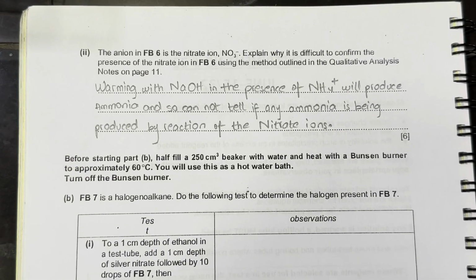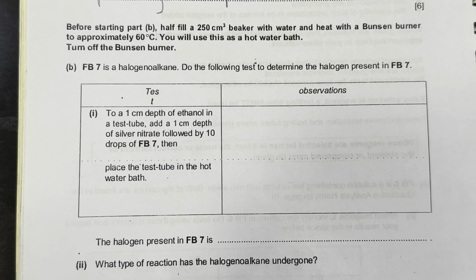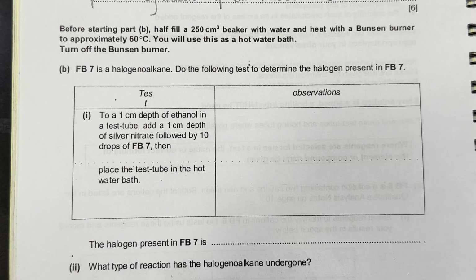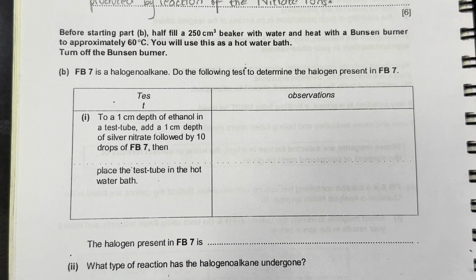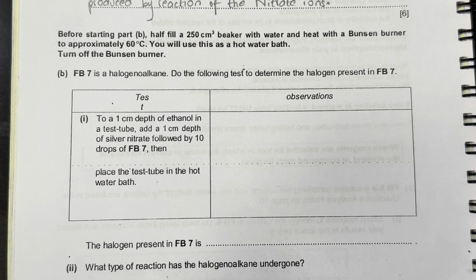So we have recorded this detail here. Now moving on to the next part, it says, before starting part B, fill a half 250 centimeter cube beaker with water and heat with a Bunsen burner to approximately 60 degrees Celsius. You will use this as a hot water bath.